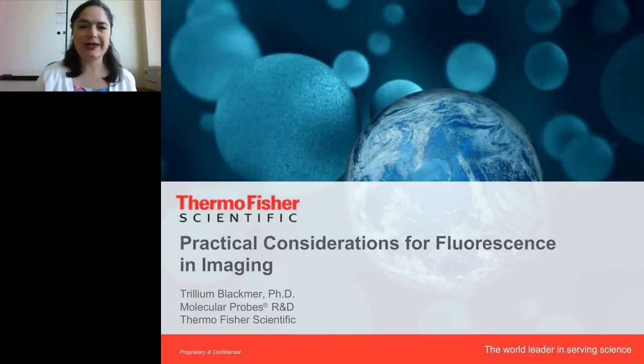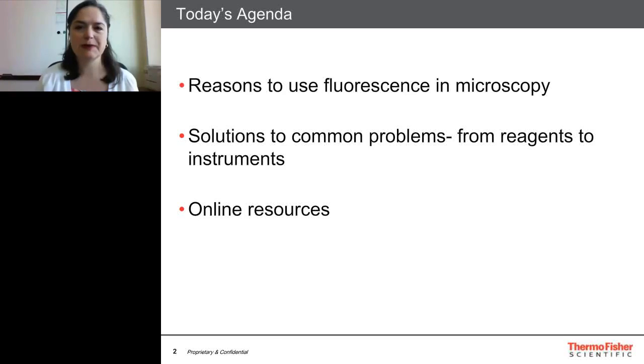Hello everyone and welcome. Today I am going to go over a few things you can do to improve your imaging experiments and also tell you about some different reagents that can help in experimental design and also in choosing what reagents you might want to use to ask your scientific questions.